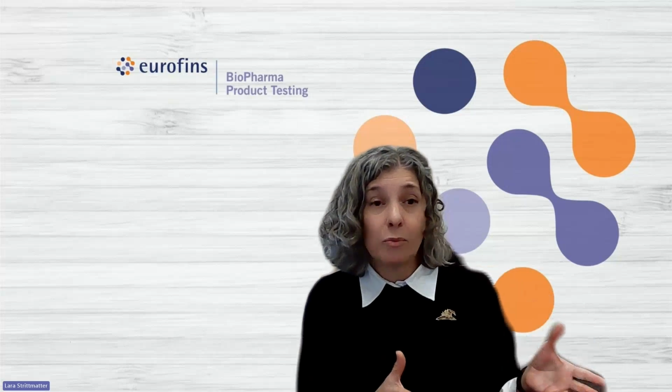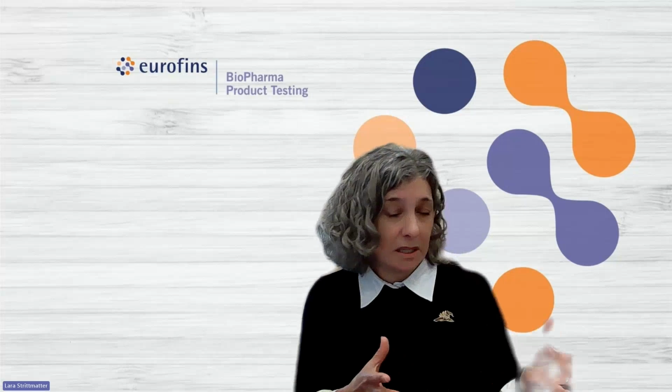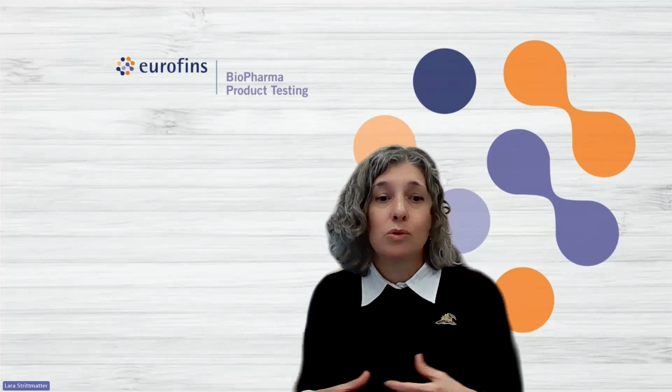In the poster, I'm going to be talking about those two. In one half, on the left-hand side, you have the challenges that the sample preparation itself presents, and they are described in table 1, and then I'm presenting some of the solutions. And then on the other half, on the right-hand side, you have the updates that we did to the imaging technique and the sampling strategy, also to try and make the test more accurate and more repeatable.